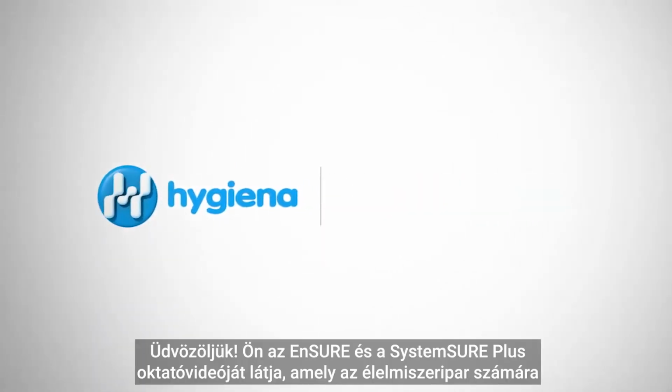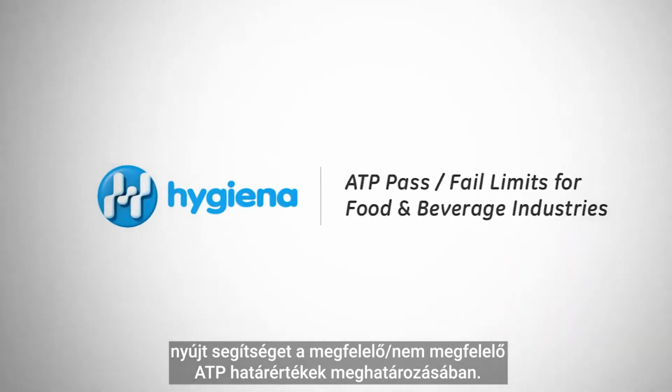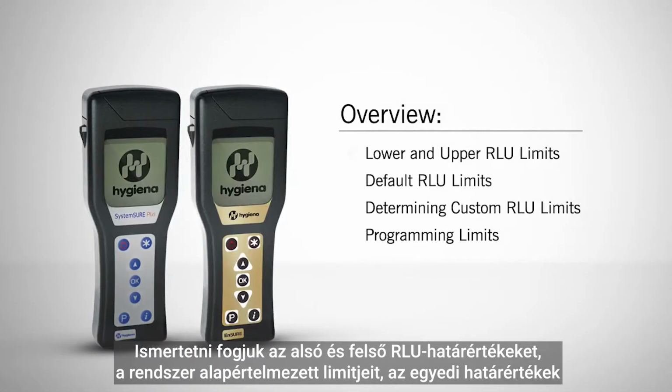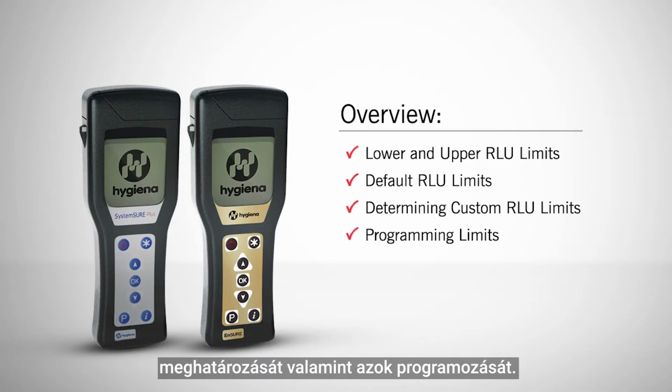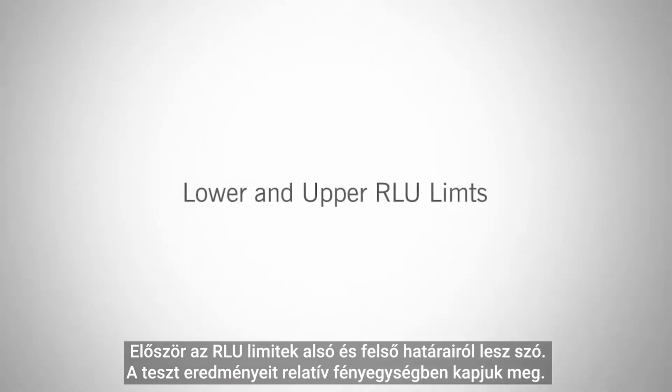Welcome to the Ensure and SystemSure Plus tutorial for setting ATP pass-fail limits for the food and beverage industries. In this video, we will cover lower and upper RLU limits, default limits on your systems, how to determine custom limits, and how to program those limits. Let's get started. The first section is lower and upper RLU limits.